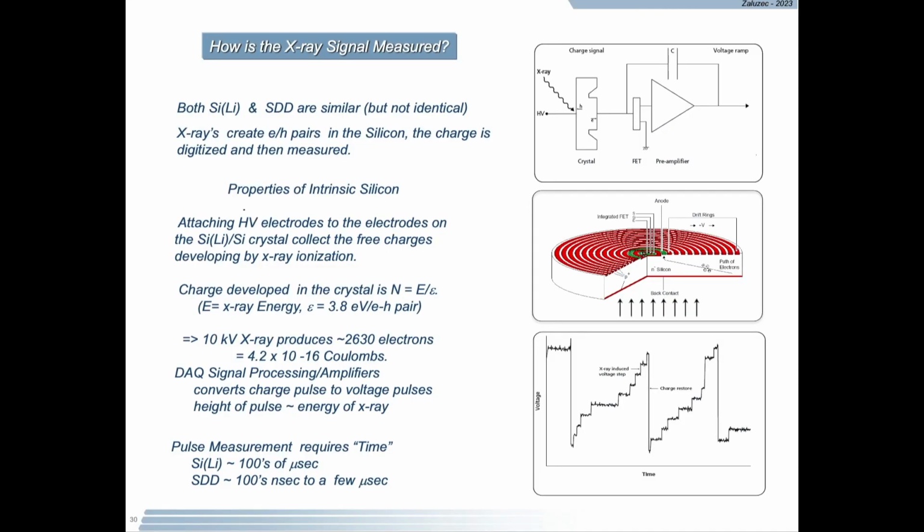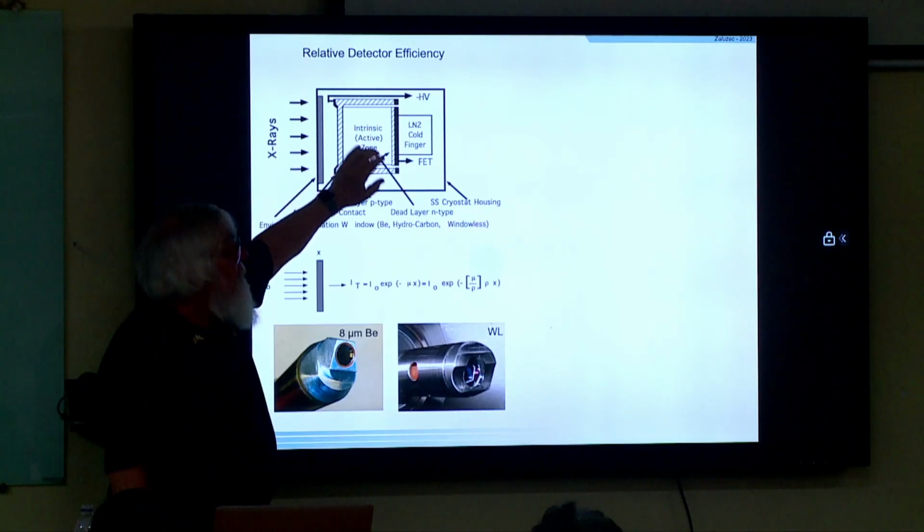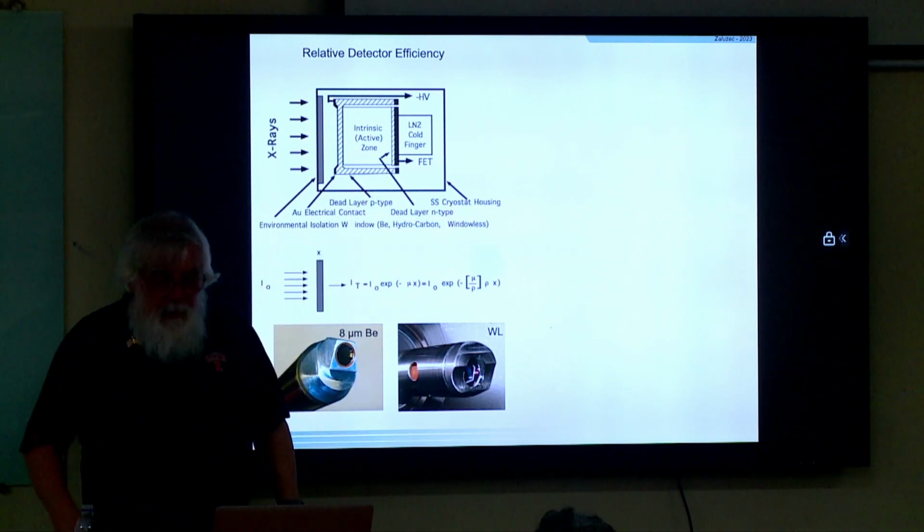Let's see, what's the next slide? Okay, so the X-rays come in. There's actually, let's finish. Two more slides and then we're done. So the X-rays come in, they enter the crystal, and we get pulses coming out.